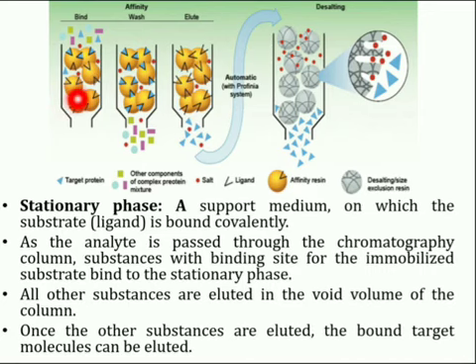First step is binding, in which ligand binds to the matrix, which is affinity resin. Second step is washing. In this step, washing is done by the mobile phase. And in the last step, target material is recovered by various techniques.